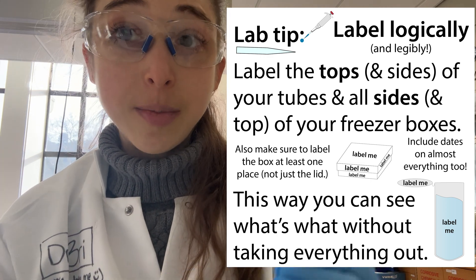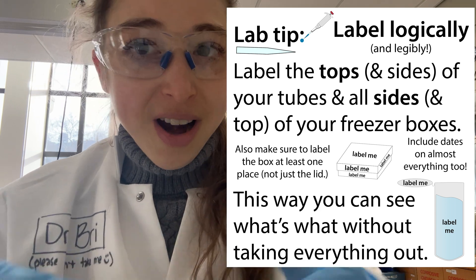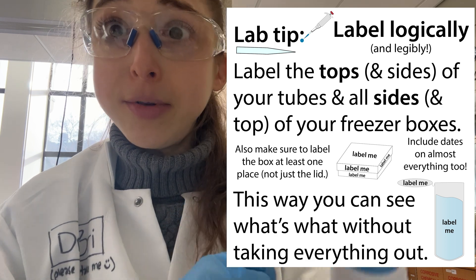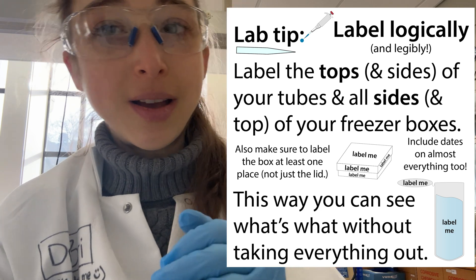If you're going to have a bunch of tubes that will be cold, what I typically do is label things ahead of time in a rack, like on paper, and get really good at tiny writing. Label the top of the tube so you can see it when it's in the box, as well as the side of the tube in case the top pops off.